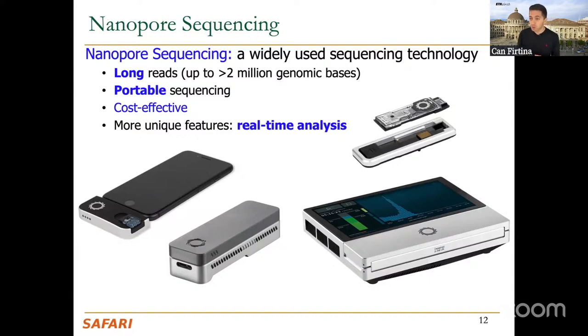As you go to much longer reads, the DNA can get tangled, so it may block you or prevent you from sequencing those reads at all. But other than this, there isn't any other major limitation that prevents us from reading much longer reads, compared to other sequencing technologies, for which I'll try to cover what limits their read lengths.